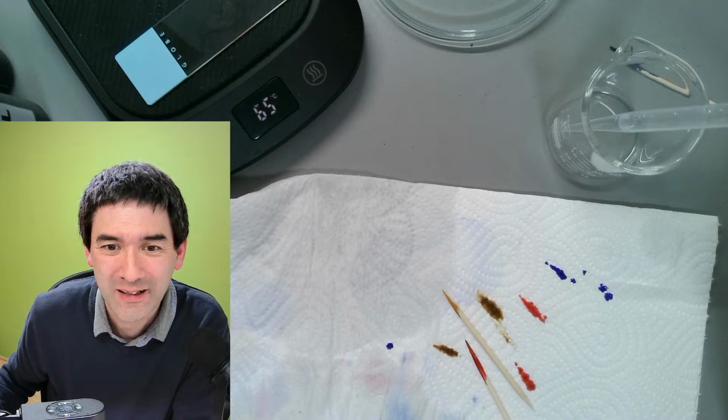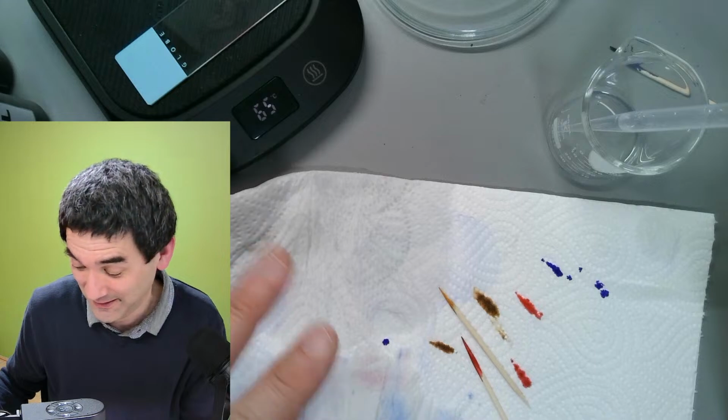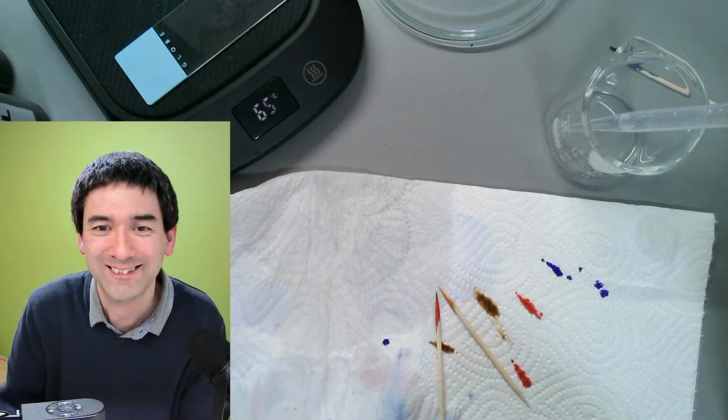Yeah, the safranin on the paper looks like blood. Yes, indeed. Also here, it's almost like you poked yourself.